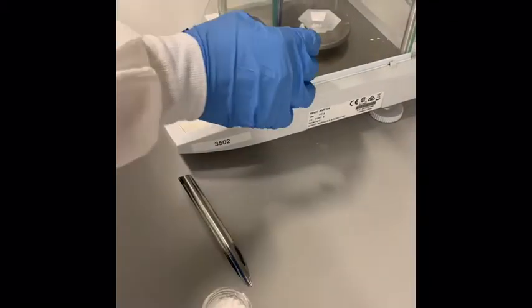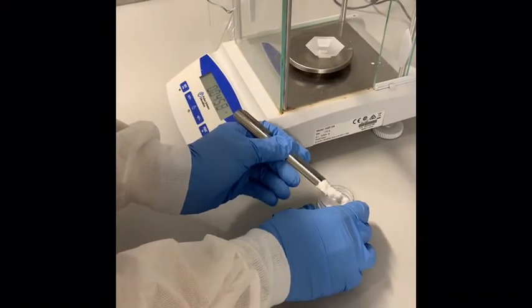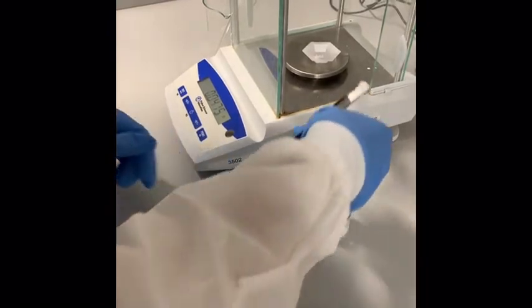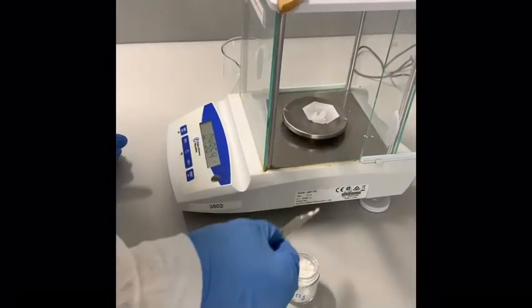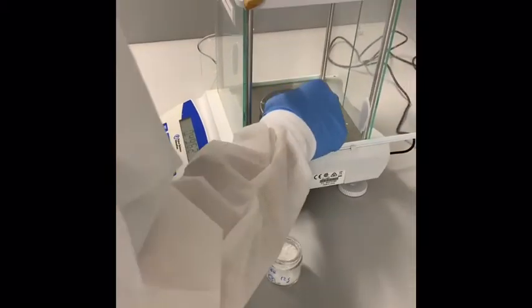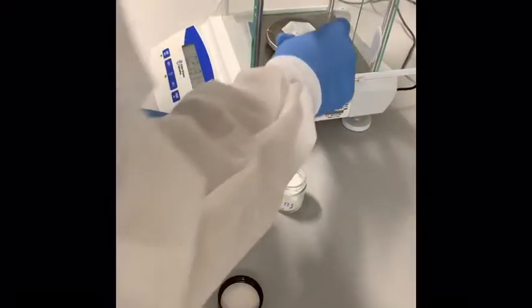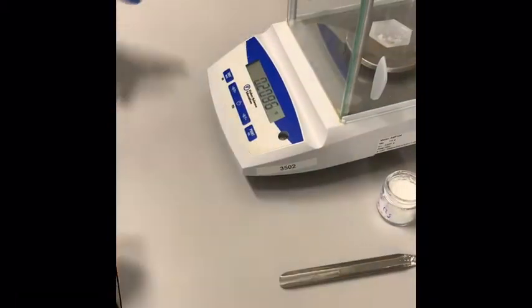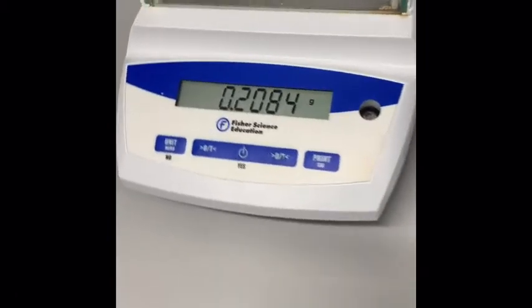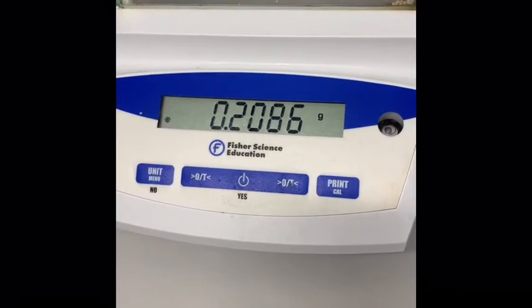Go ahead and leave that on there and just go in from the sides. Take a little bit more. While he is recording the weight, you can record it for your post-lab report. It's about 0.2086 grams.